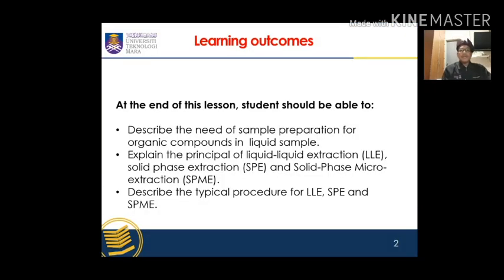Okay, this is our learning outcome for today's lesson. After completing this module, students should be able to (1) describe the importance of sample preparation of liquid samples for organic compounds, (2) explain the principle of liquid-liquid extraction, solid phase extraction (SPE), and solid phase microextraction (SPME). And finally, students should be able to describe the typical procedure of LLE, SPE, and SPME in a safe and controlled manner.